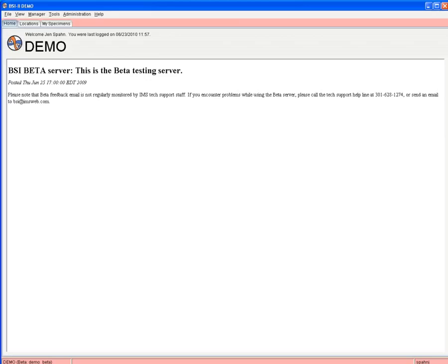These changes were implemented to basically make the system easier to use for simple tasks such as withdrawing a specimen or adding one specimen at a time. Again, we will cover the My Specimens interface and changes to locations as well as the right mouse button menu.